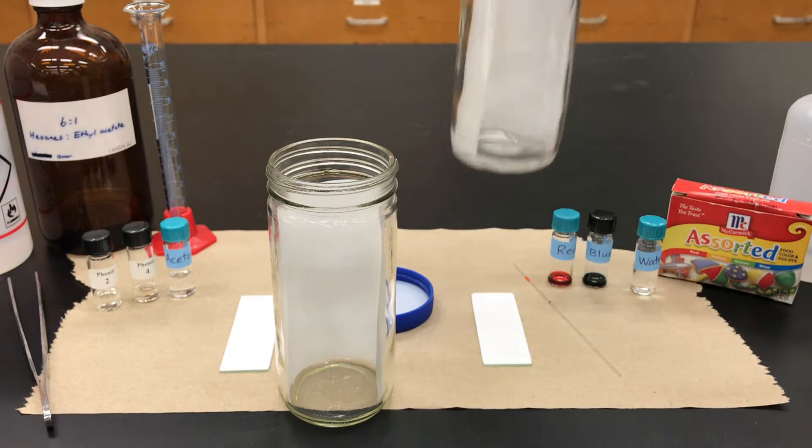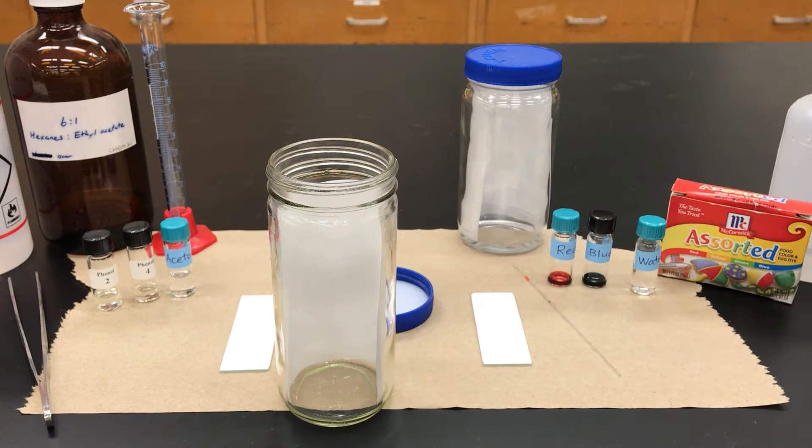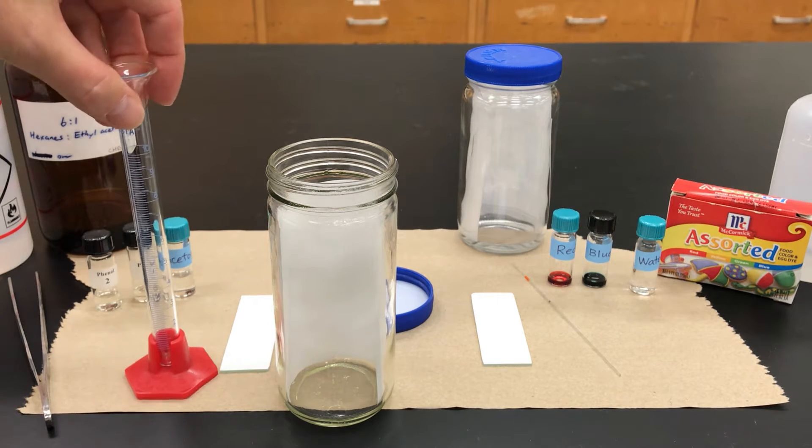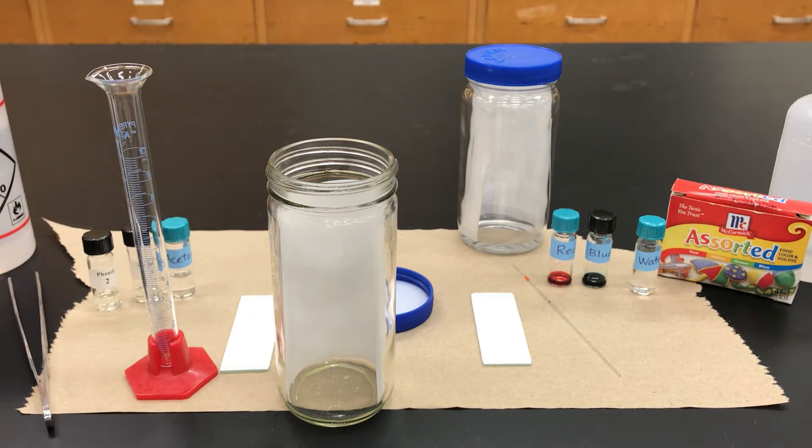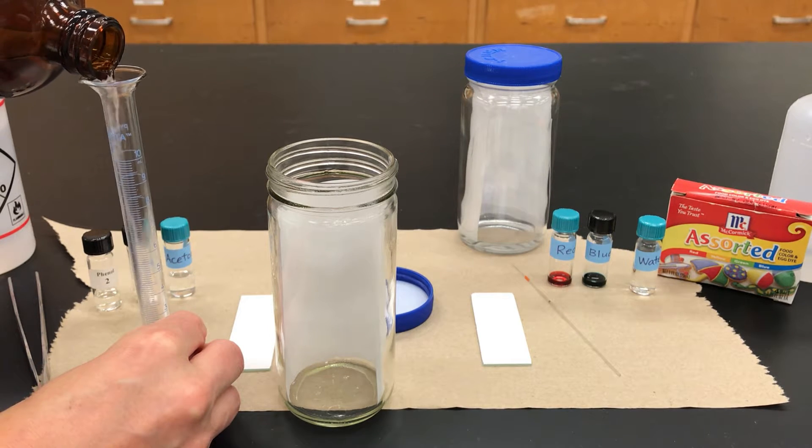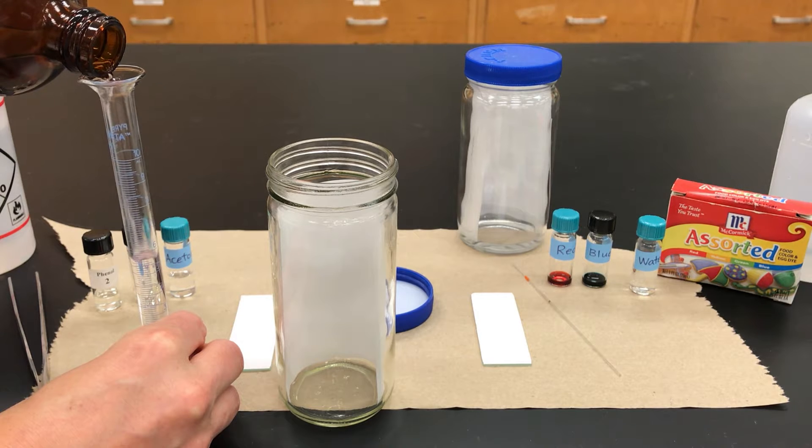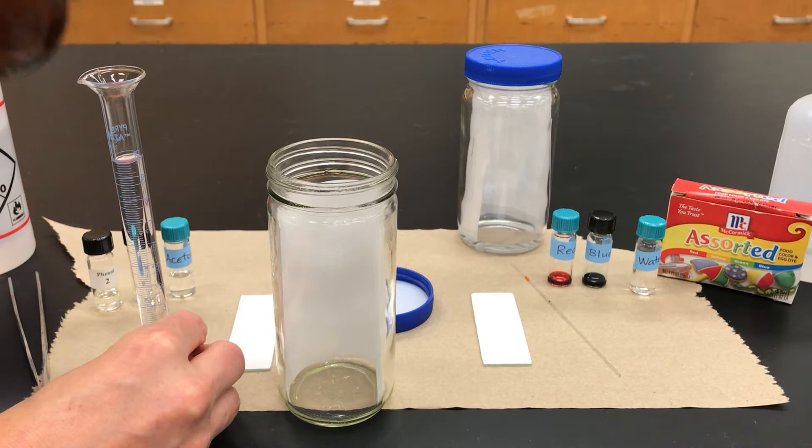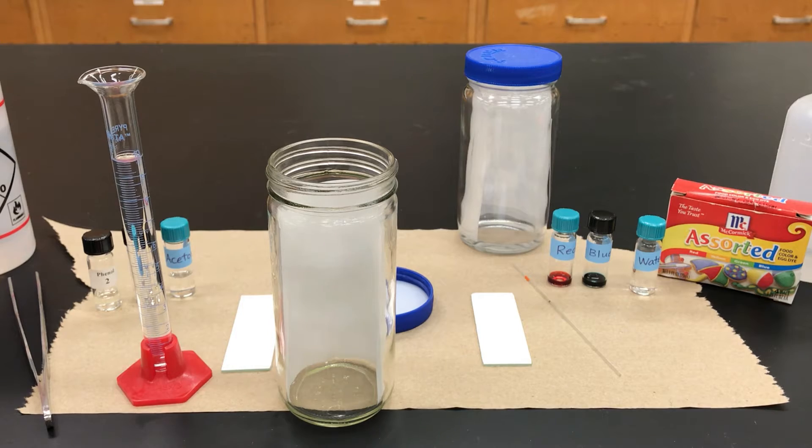The point of the filter paper is that as you run the TLC, liquid is going to crawl up this plate, and if you don't have the chamber saturated with vapors, it might just evaporate and dry up as it goes along. So by having that filter paper wet, it really promotes a saturated environment and lets the TLC run better.